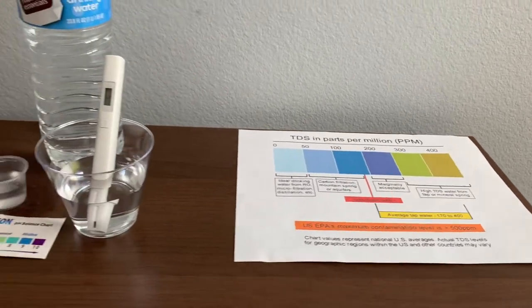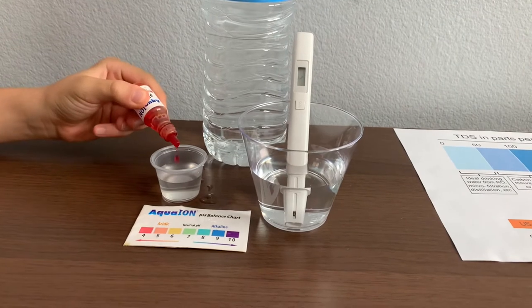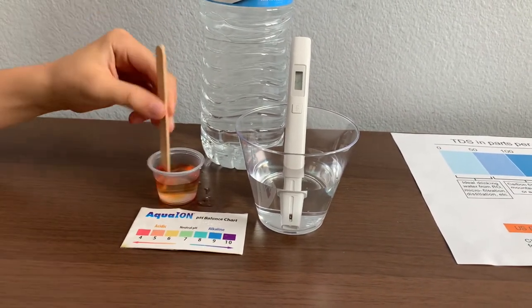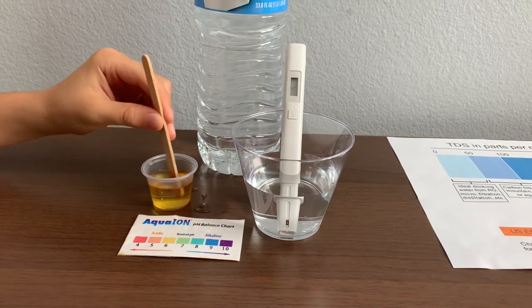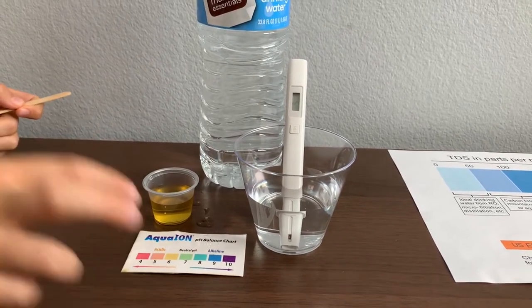Now let's test the pH. Only do two drops. Let's stir it a little for a better result. I give this a six — this is a six.